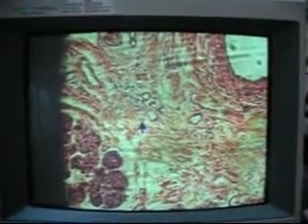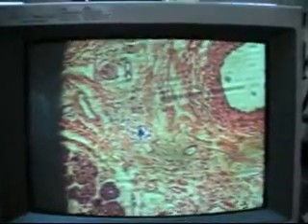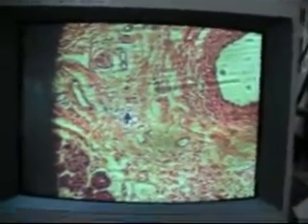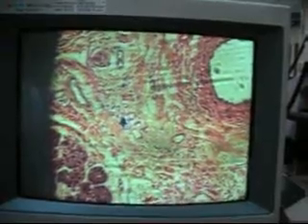I mean, they're going to be like, for example, this size right here, and I don't know whether that could be one, but that's what you're going to be looking at essentially. And it usually will show 1 nucleus, and then if you look carefully, you'll be able to see that the cytoplasmic arms reach around and touch one another. So tiny. So there's one that's right.